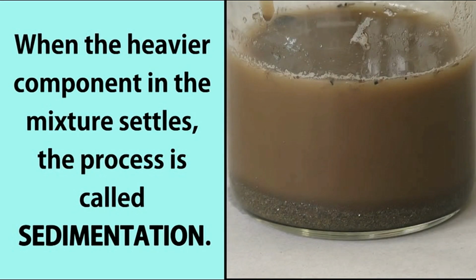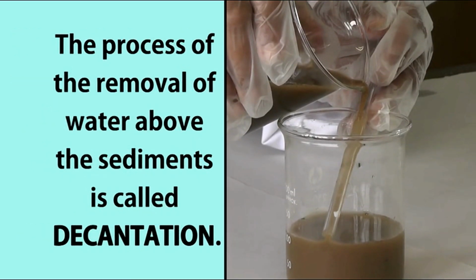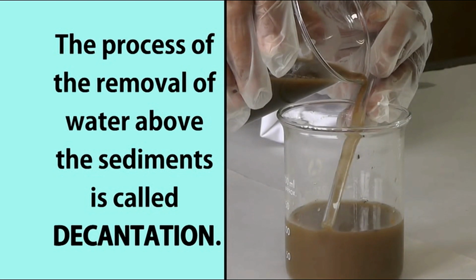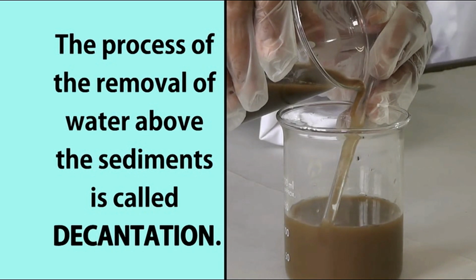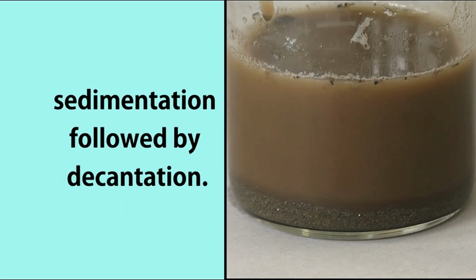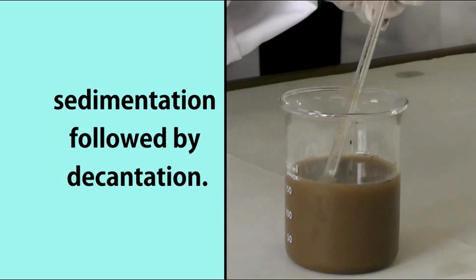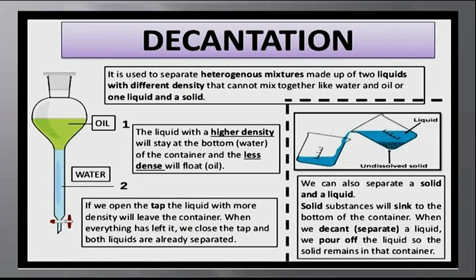In this experiment, we have learned that when the heavier components in the mixture settle, the process is called sedimentation. The process of the removal of water above the sediments is called decantation. Soil can be separated from the muddy water mixture by sedimentation, followed by decantation. Decantation can also be used when separating oil floating on water.